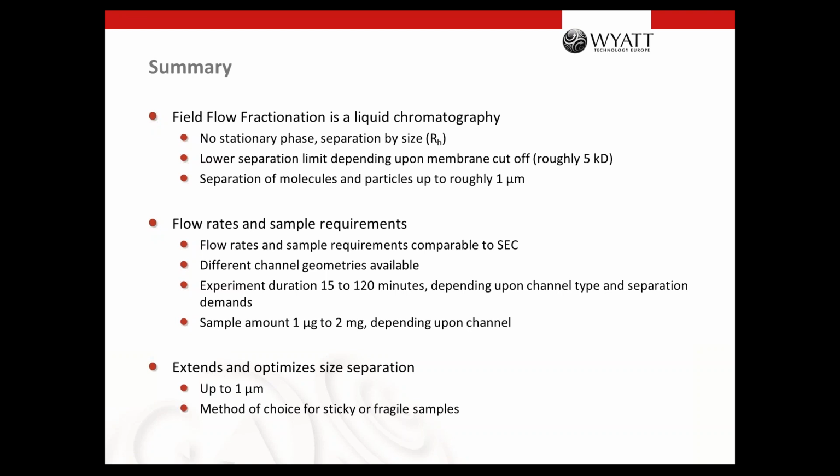And where should you use FFF? It's optimal if you have very huge particles, bigger than 50 or 100 nanometers, because normally you cannot measure or separate these by a SEC column.